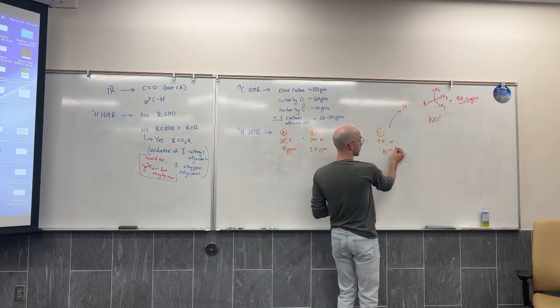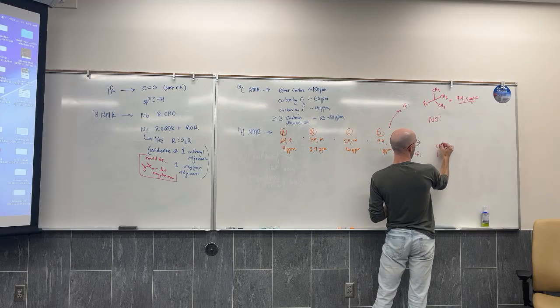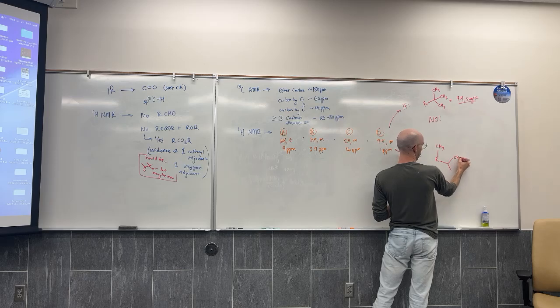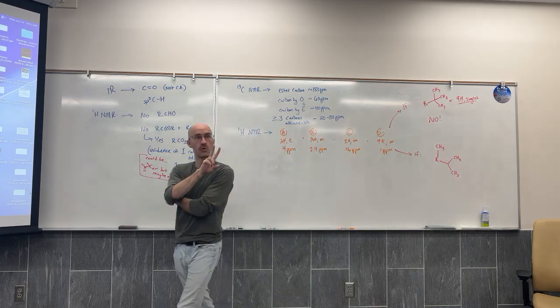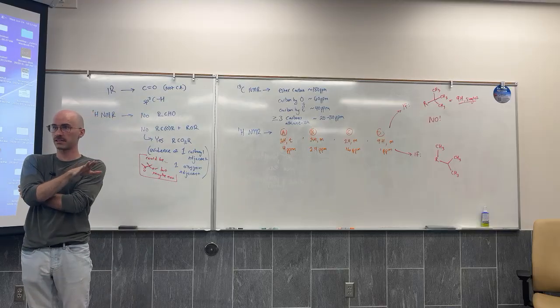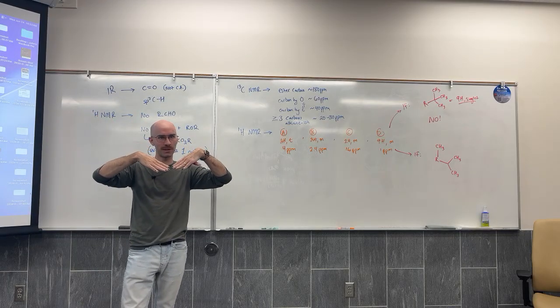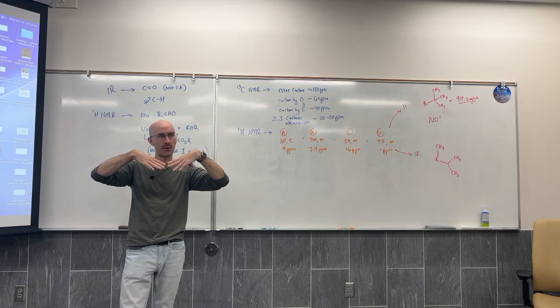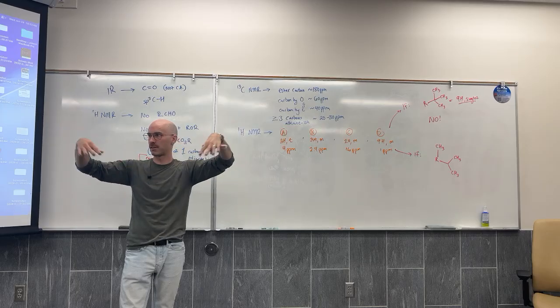Then I'm going to say if this is one CH3 somewhere in the molecule and two different CH3s somewhere else in the molecule. Are you guys okay with, I'm just brainstorming here and I don't know what the rest of the structure looks like, but I'm saying maybe they're just connected by the rest of the structure somehow.